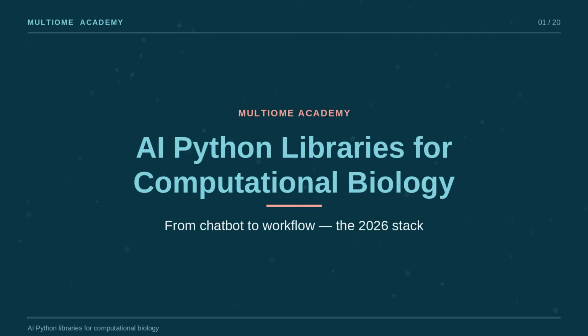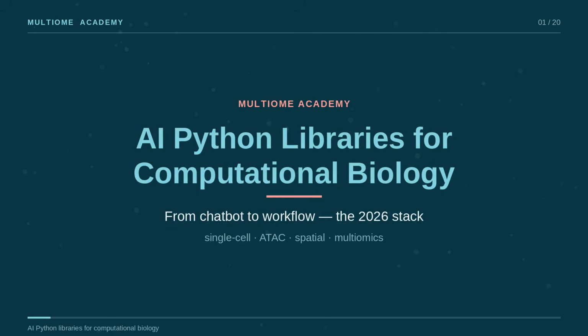If you analyze single-cell RNA sequencing, ATAC sequencing, spatial transcriptomics, or multiomics, you already know where the bottleneck is. It isn't sequencing anymore, it's interpretation. In this video we'll go through the Python libraries that let you build AI directly into your analysis workflow, what each one is actually for, and how they fit together into a single reproducible pipeline.